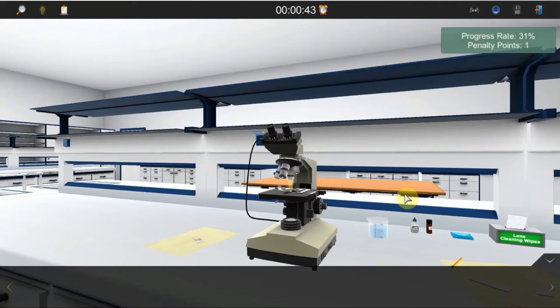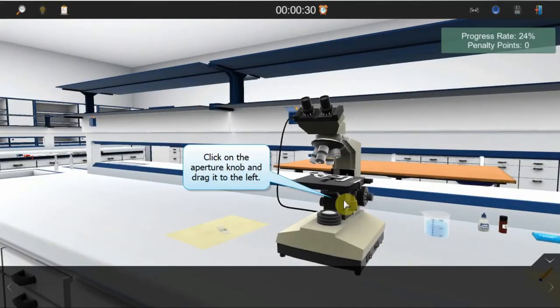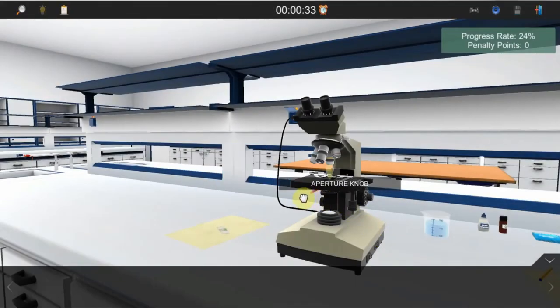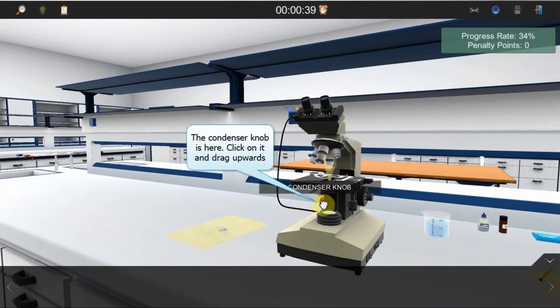Let's now continue with the correct sequence of the experiment's steps. Set the iris knob to the left-most position. Lift the condenser knob up to the highest point.